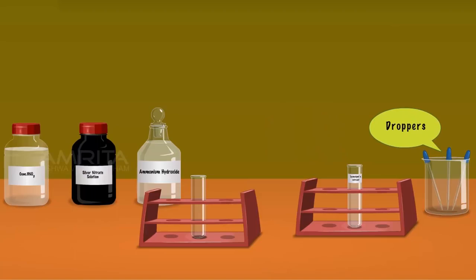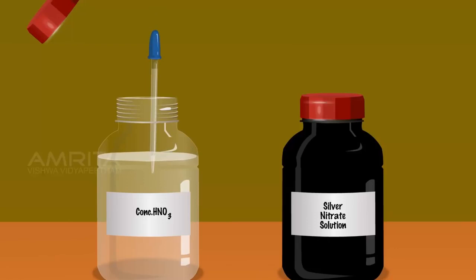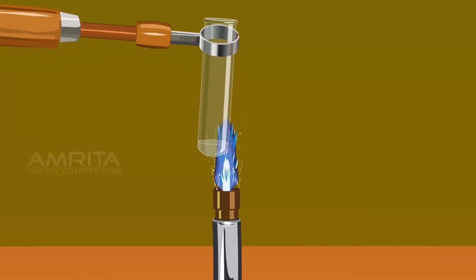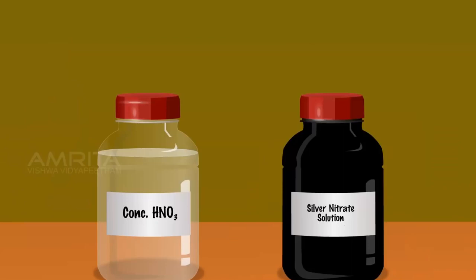Take a small amount of Lassaigne's extract using a dropper and pour it into a clean test tube. Using another dropper, take a small amount of concentrated nitric acid. Hold the test tube using a test tube holder and add concentrated nitric acid into the Lassaigne's extract. Boil the contents of the test tube over the Bunsen burner for some time, then cool the contents. Take a small amount of silver nitrate solution using another dropper and add it into the contents of the test tube.